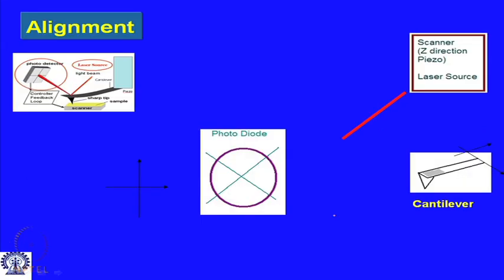We had also talked about the sequence of alignment. So, these are the hardware elements you have. You have the cantilever and the probe sitting over here, which has this reflecting surface, which can be seen from this particular shining silver area. You have two sets of screws for movement in the x and y directions respectively.